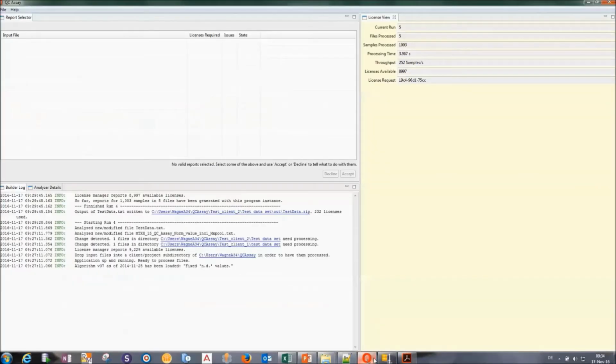Okay, now with this, you should be able to assess the quality of your samples. And if you have any questions, you can always go to the manual to try to find your frequently asked questions, so to say, or you can always come back to Metanomics Health and ask for assistance.